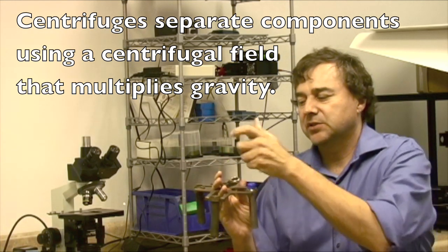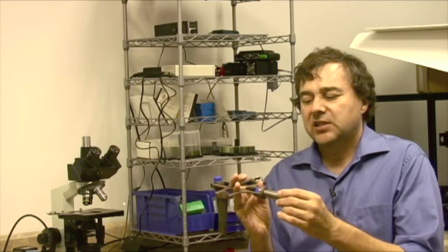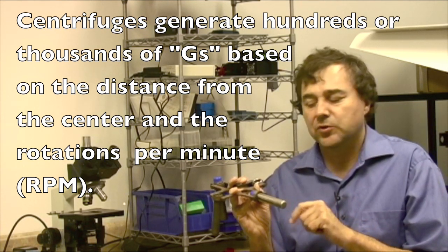Now if I add a couple of samples and we spin those, as you can see the sample is now going to be spinning and centrifugal force is going to be applied to whatever's in the tube.